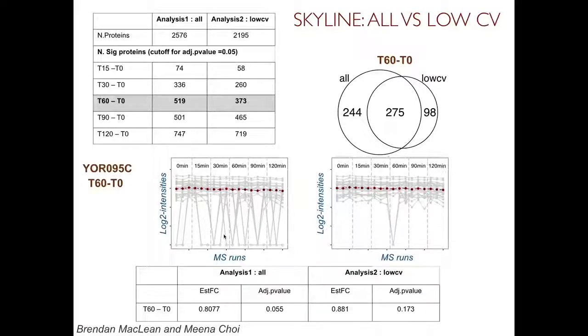And so going back to your question, I think many of these features would be viewed as missing if we impose this censoring cutoff that we have, right? And then it is possible that many of these features would be in a situation that you describe, and they didn't make their way to this type of filtered analysis. So at that stage, especially if you have many features which are missing a lot, I personally think that it is better to have our data more clean upfront as opposed to trying to deal with them statistically after the fact. This one survived, right?